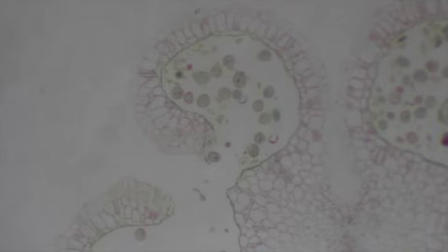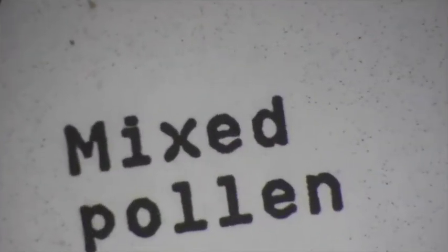Okay, now we'll follow this up with a prepared slide of mixed pollen from a lot of different flowering plants. So plants can use a variety of different strategies to get their pollen to where they want it to go. Okay. And one of the key things about flowering plants is that flowering plants have flowers, and those flowers are specially adapted to work with pollinators. As a result, then there's a lot of different types of pollen out there that's associated with the specific pollinators that can move that pollen.